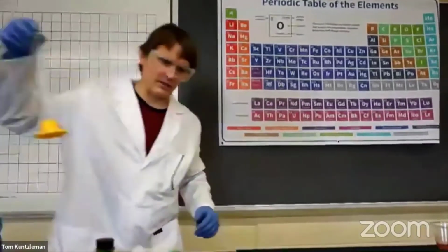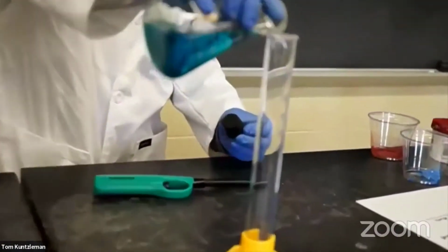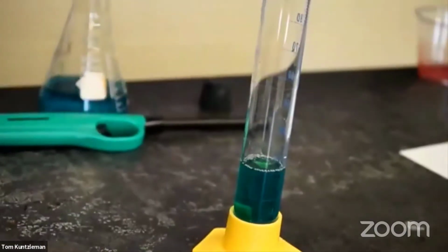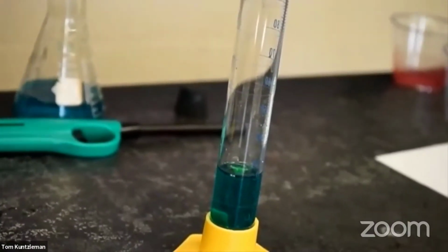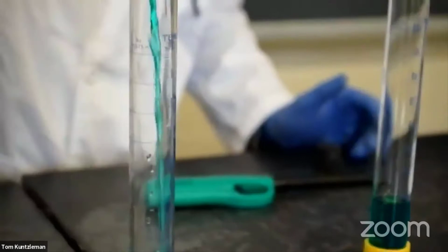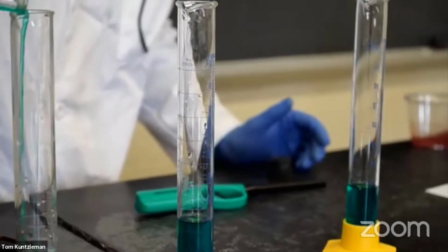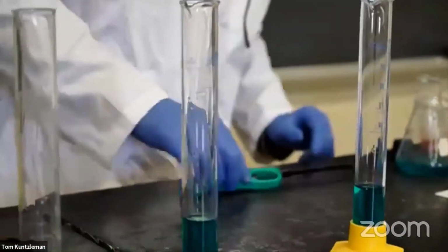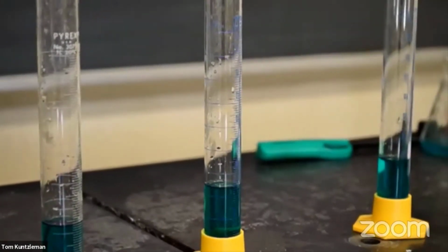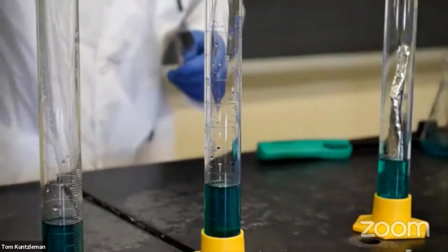Aluminum is a very, very reactive metal, very reactive. And so I'm just going to add some aluminum for this, and we'll see what happens. We'll see if we can get the aluminum metal to react with the copper ion. I'll put up a couple of these. Get 3 going. A little more fun to do 3, I think. All right. And then we'll put in some aluminum foil, and we'll see what happens. Here we go. In goes the first one. In goes the second one.